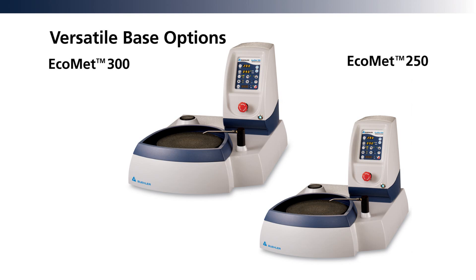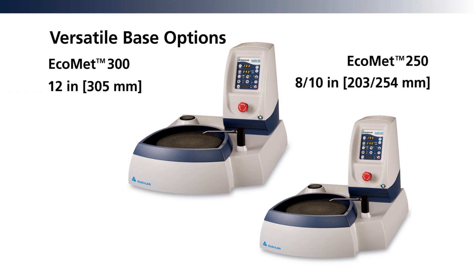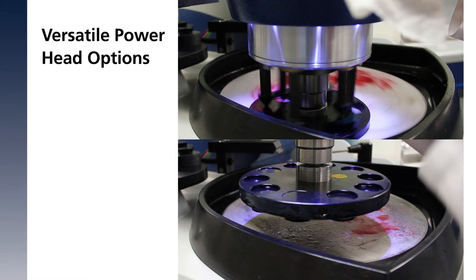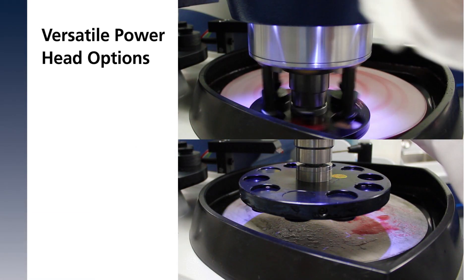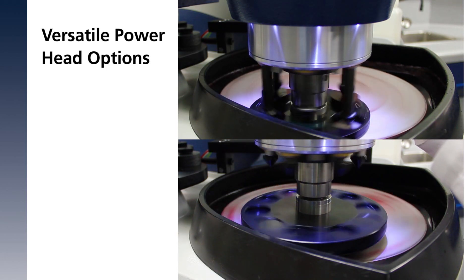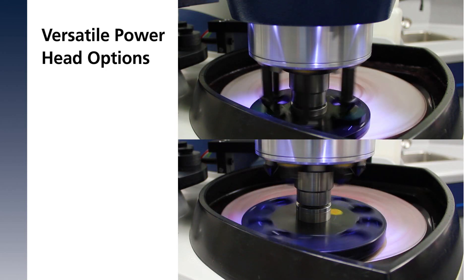Select the durable base that best fits your application. The EcoMet 250 is capable of handling 8 and 10 inch platens, while the EcoMet 300 handles 12 inch platens. Further tailor the unit with a variable speed AutoMet 250 or 300 powerhead.